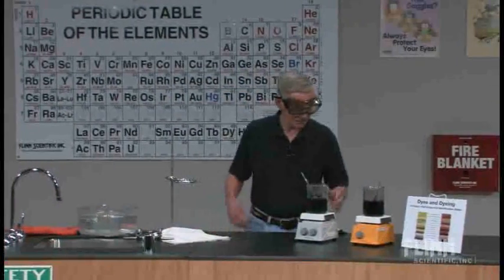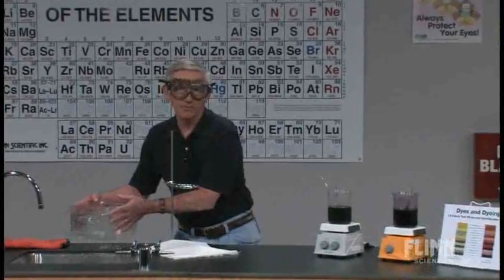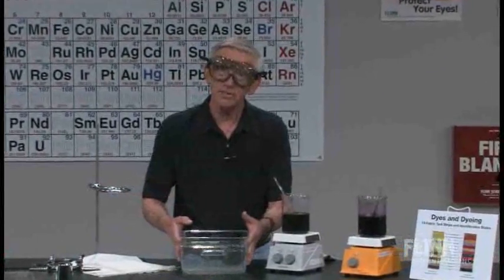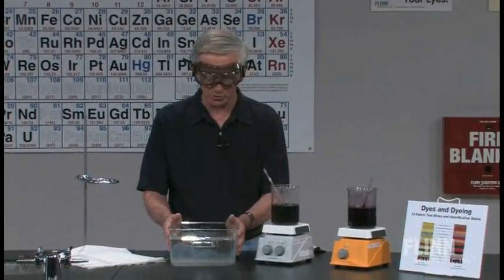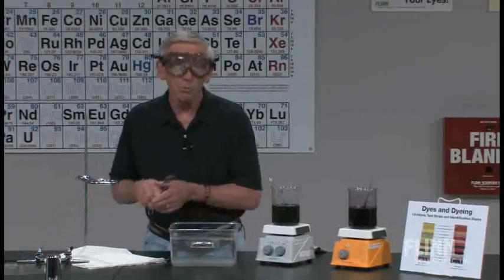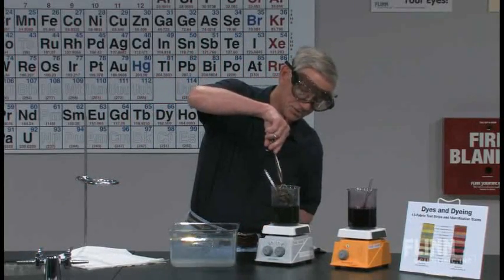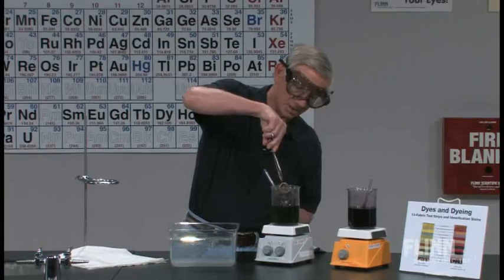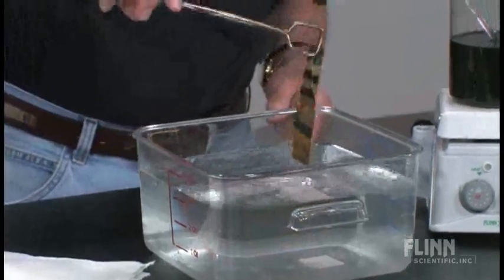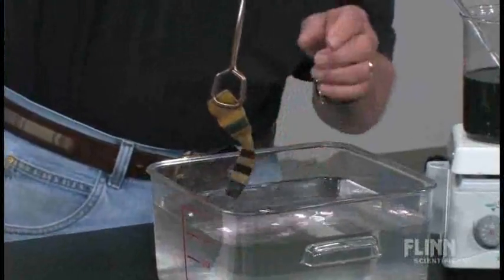We're back in here. The samples we put in have pretty much finished cooking. I thought it might be fun to see what comes out. Depending on the setup of your lab, you might want to use a tray like this. If you're close to a sink, go to the sink. We need to take these out and rinse them. This was the number one fabric material.